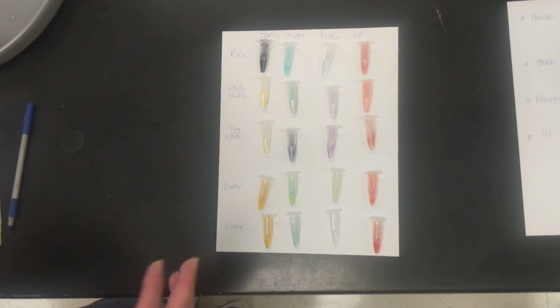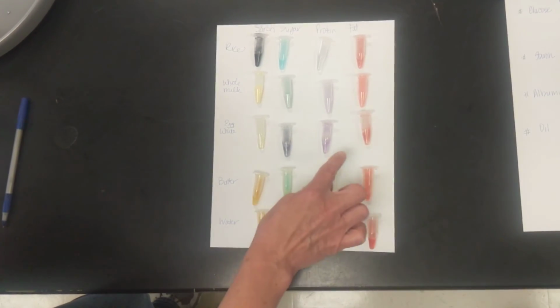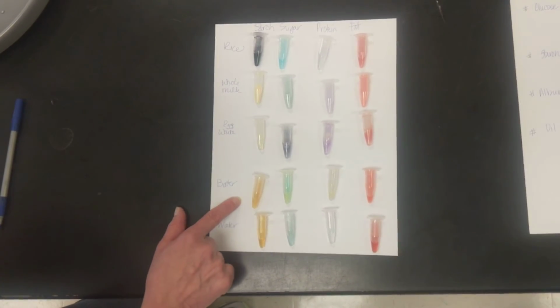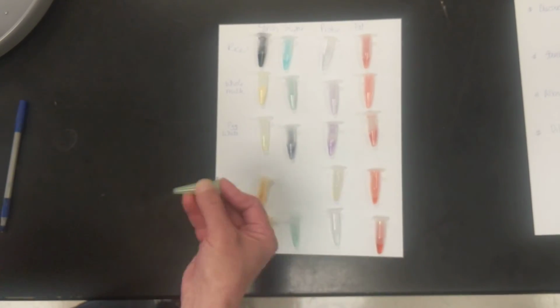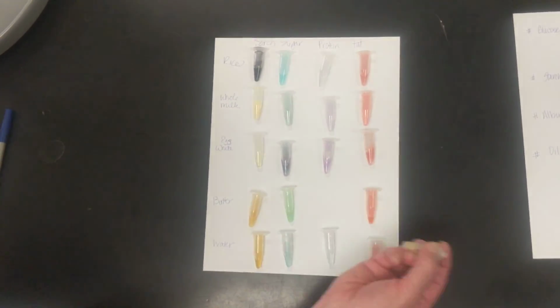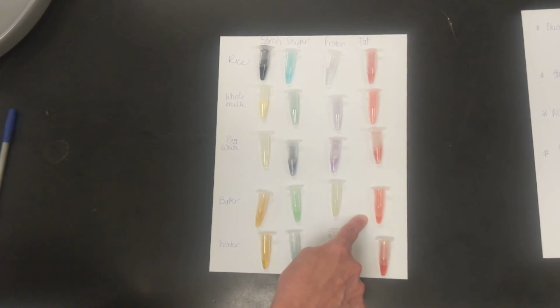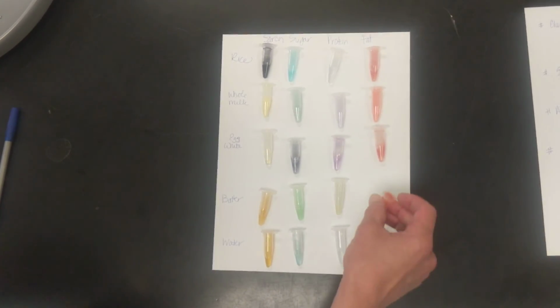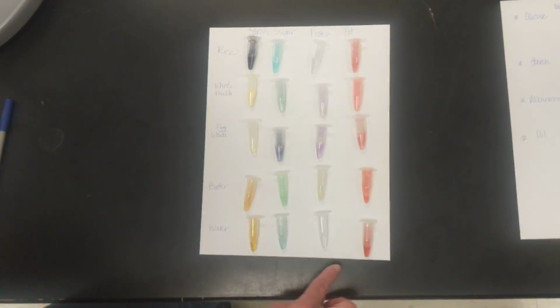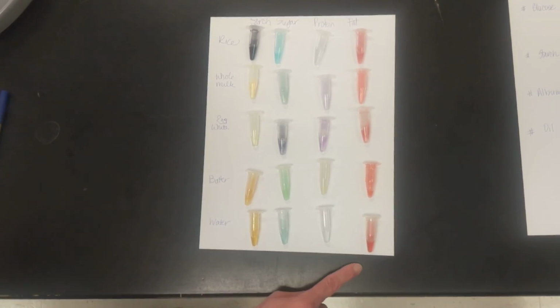Sugar, that's a purple color, so that's not in our range of sugar. It does have protein, and this looks like the dull maroon, so no fat to that. Butter, no starch. This might be a little bit green, so there might be just a touch of sugar in there. This one did not turn the violet color, so there's no protein in our butter. And for fat, this is definitely a bright red color, okay? Very different than our other reds that are darker. Water, no starch, no sugar, no protein, and no fat.